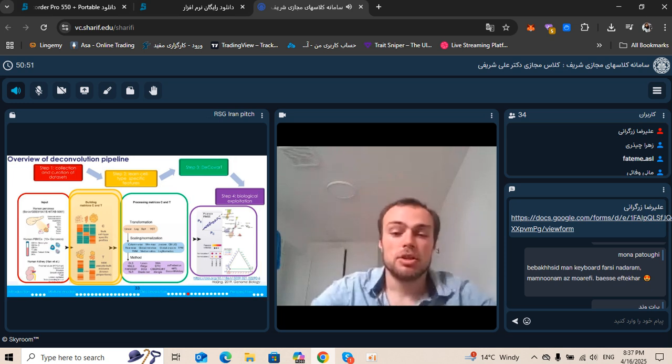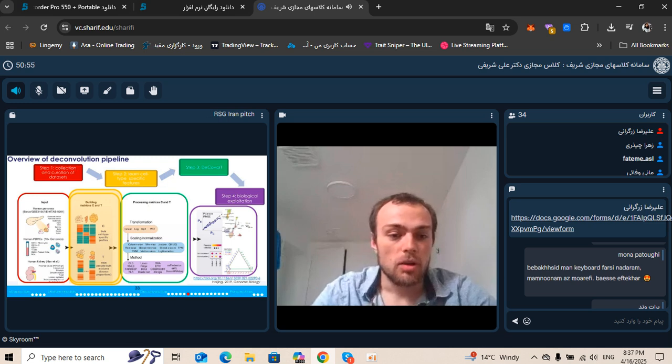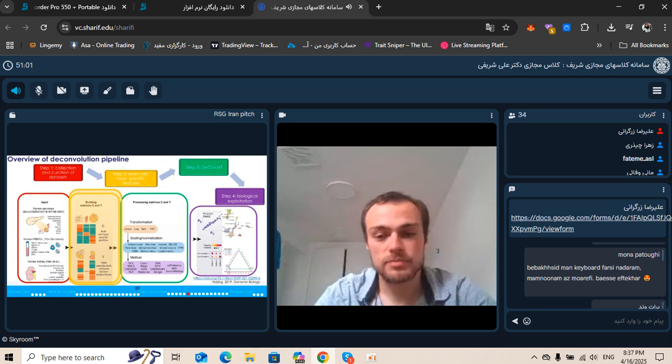Okay. So now that I have collected all these datasets and cleaned them, the next stage is, of course, to infer the characteristics, the features of each of my cell profiles.